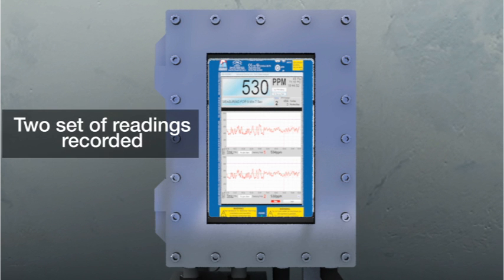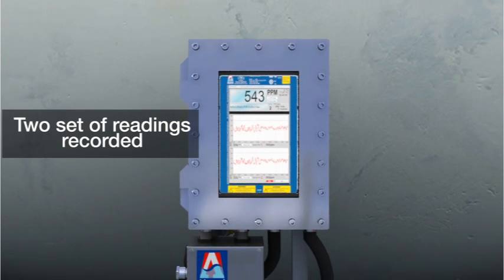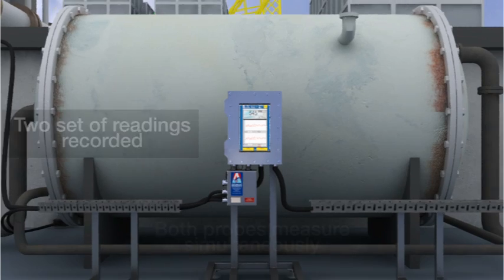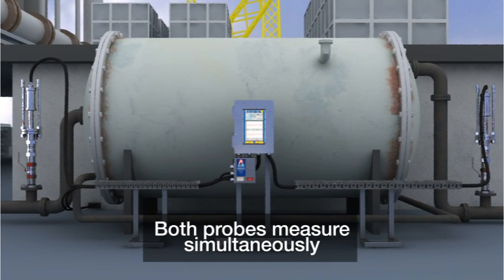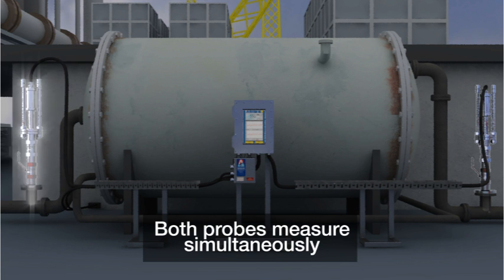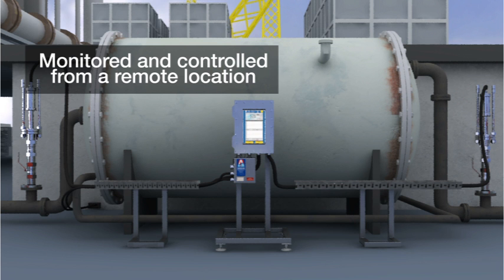To enhance the process measurement capabilities, Advanced Sensors have developed the inline probe analyzer to measure two points simultaneously, giving true process monitoring capabilities. Once again, all analyzers are monitored and controlled from a central or remote location.